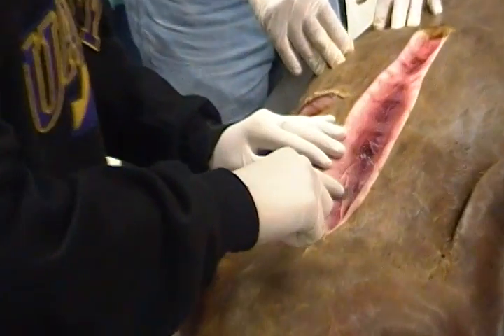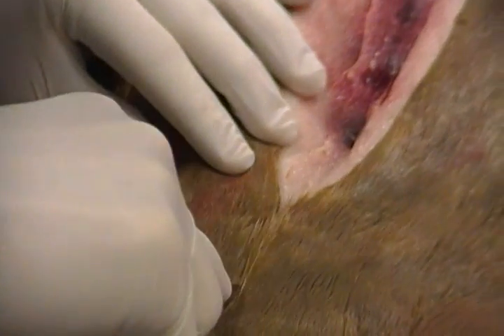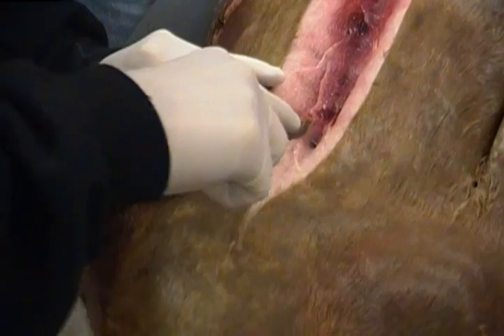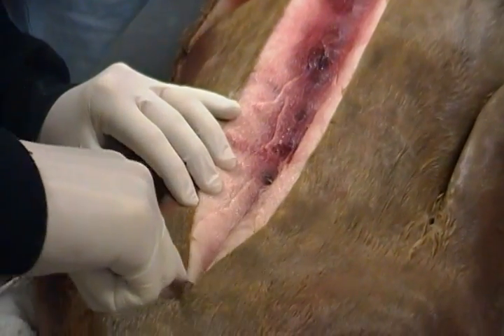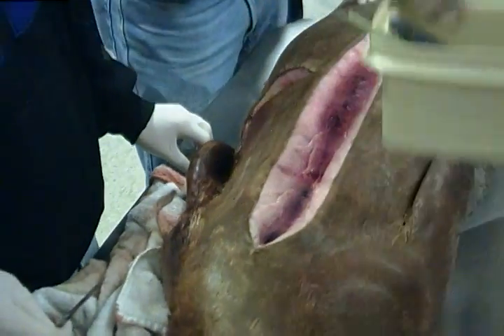Beautiful. Perfect. That's perfect. Just a little further. A little further. Wow, that's pretty interesting. That's good. So you can see the blubber, you can see the skin layer, blubber, and just the muscle here. Is there another scalpel? Good.